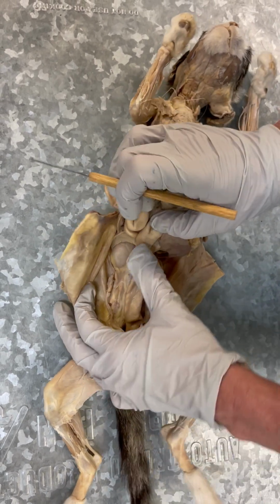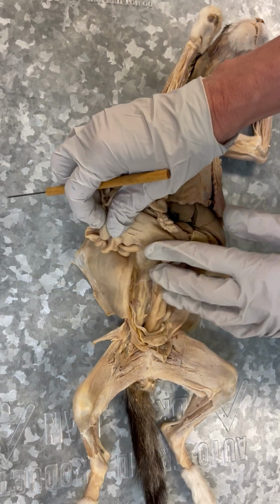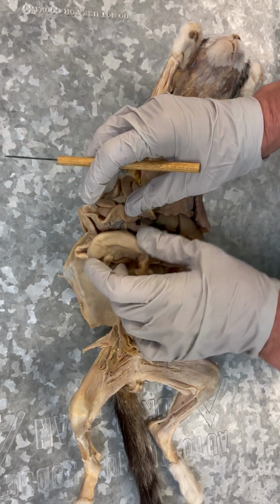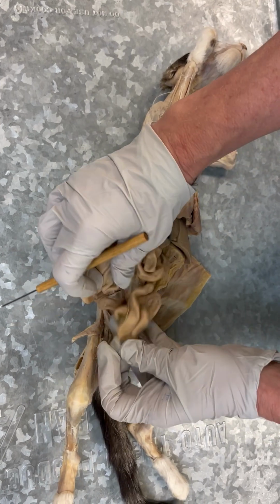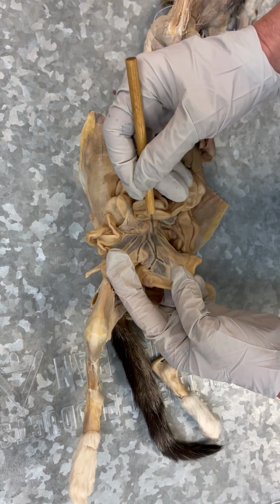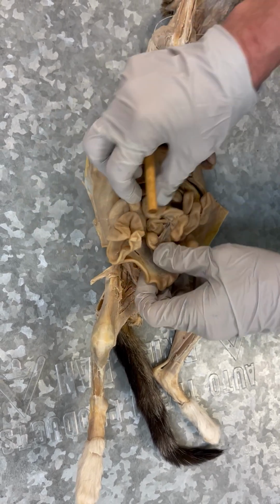Over here, this is the descending colon, and when we straighten it out, you can see that this would be the transverse colon. So it goes transverse, then descending, then to the rectum. When you look at the intestines, you see the mesentery. The mesentery has the lymphatics, the blood vessels, and the nerves that serve all of these intestines. So this should be clear, as you can see.